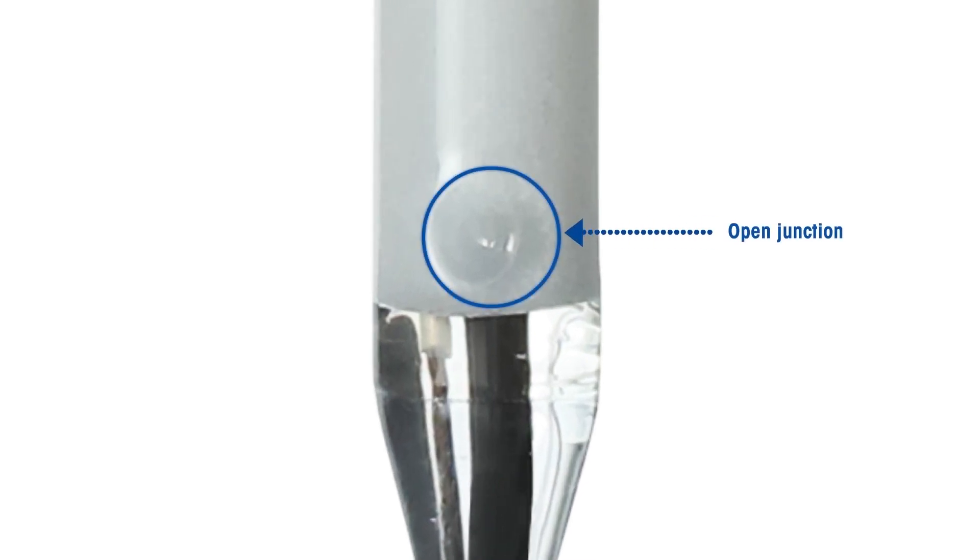The electrode has an open junction, which avoids clogging, and it's easy to clean.